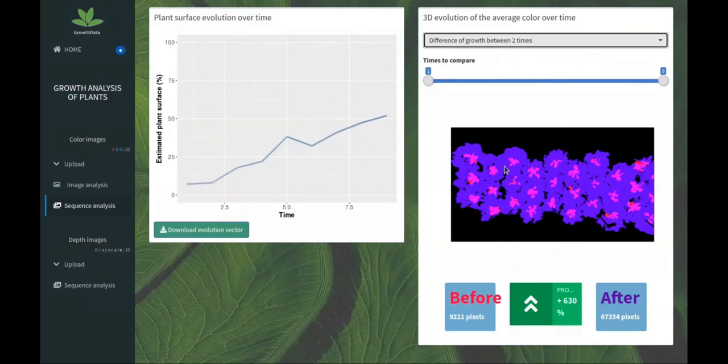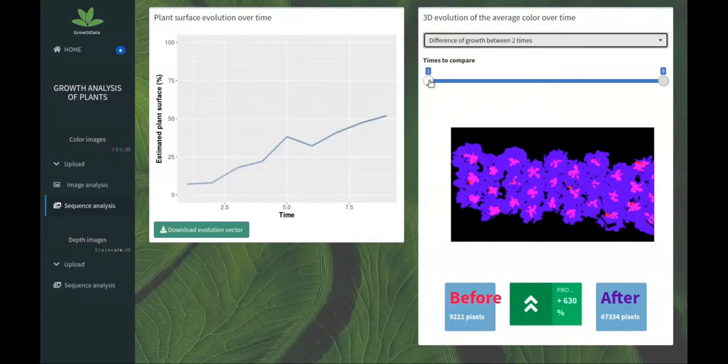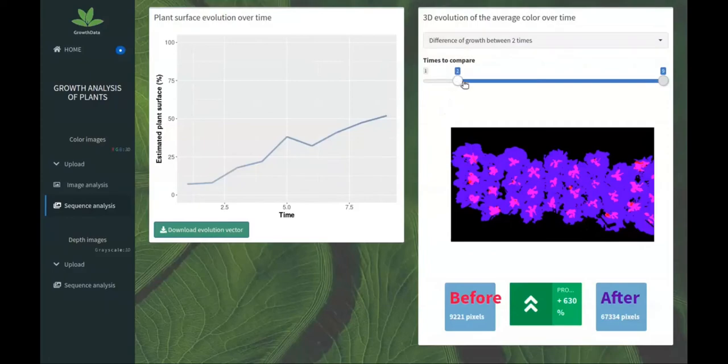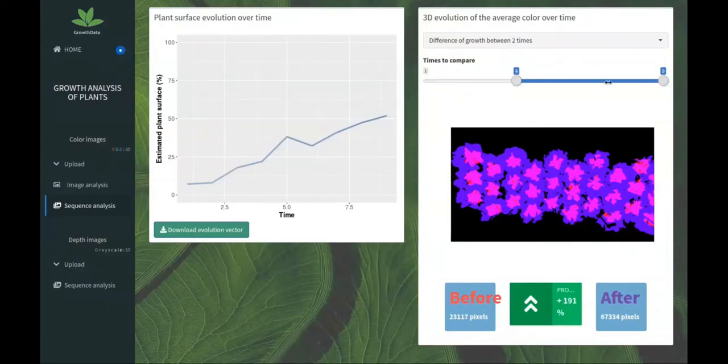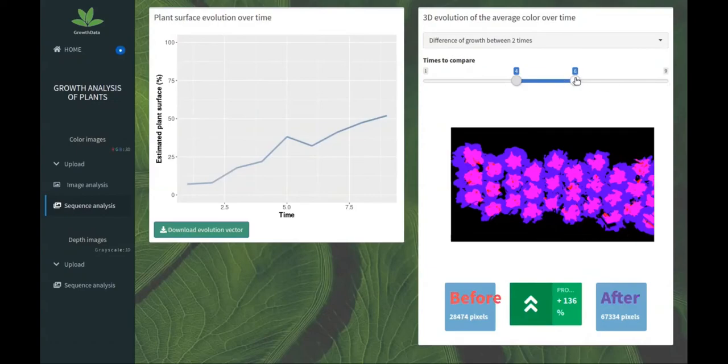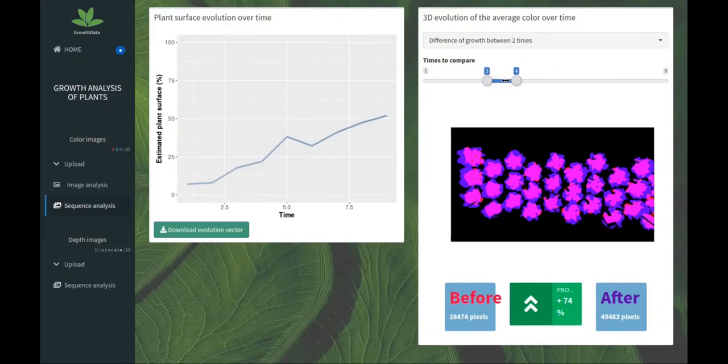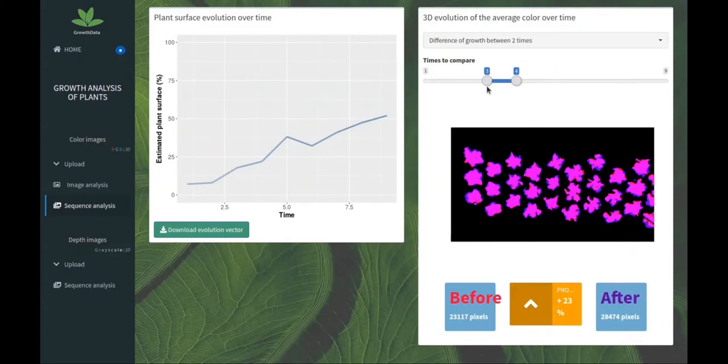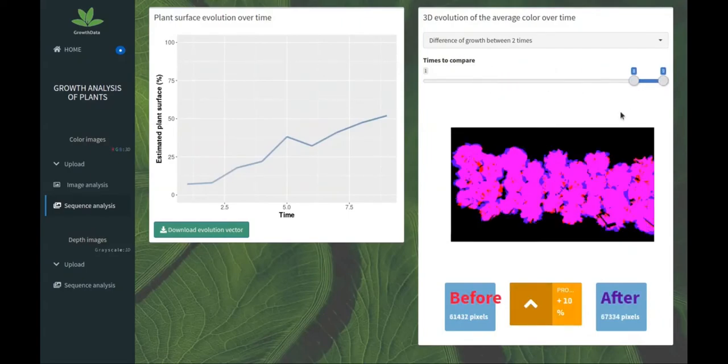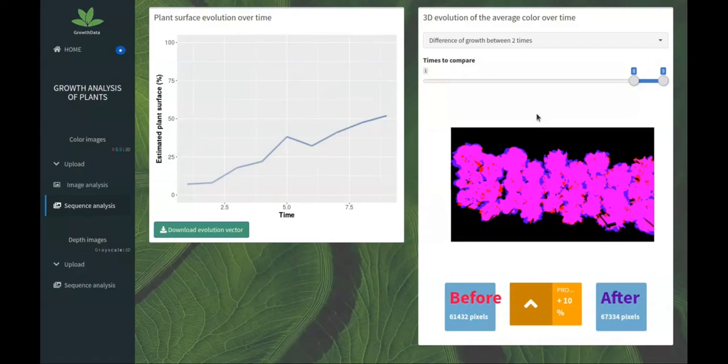Let's go to the tool for comparison between two times. We have two masks, blue and red. Where it's pink is where the masks are confused. We have some estimation of percentage of evolution of surface. Here we have plus 10% of pixels covered by the salads.